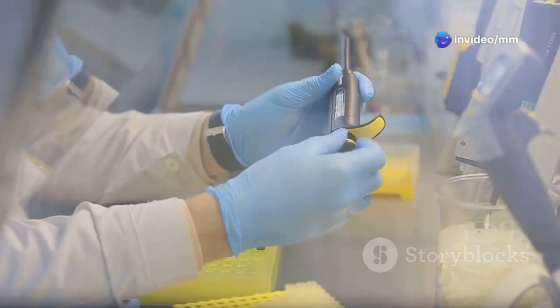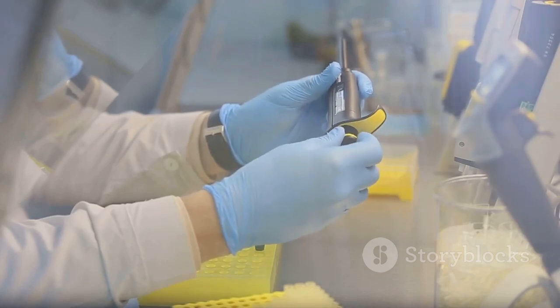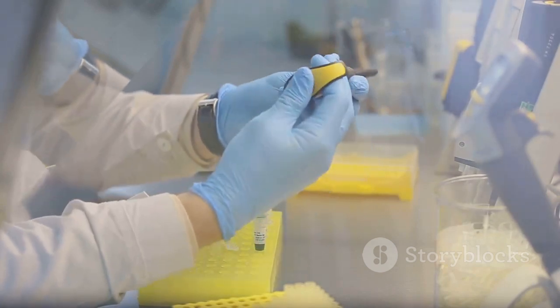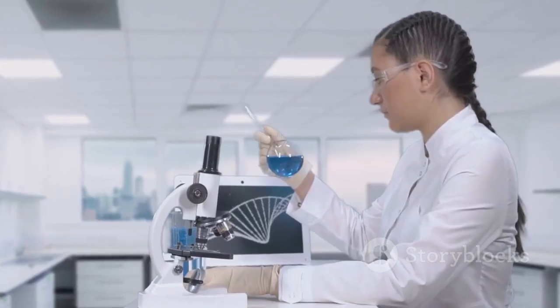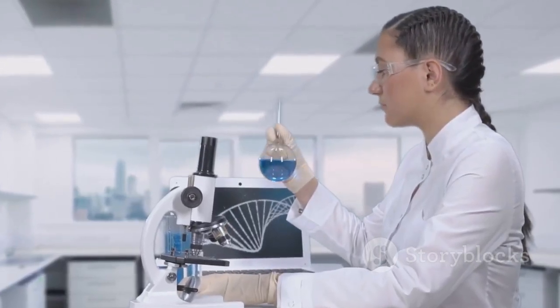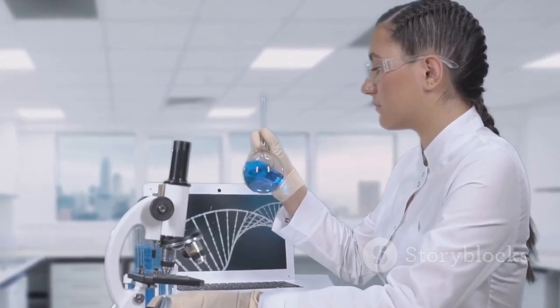Sanger sequencing, although not the fastest or cheapest sequencing method available today, remains a gold standard for its accuracy and reliability, especially for smaller scale projects. It's like having a trusted magnifying glass to examine the fine details of DNA, providing invaluable insights into the intricate workings of life.